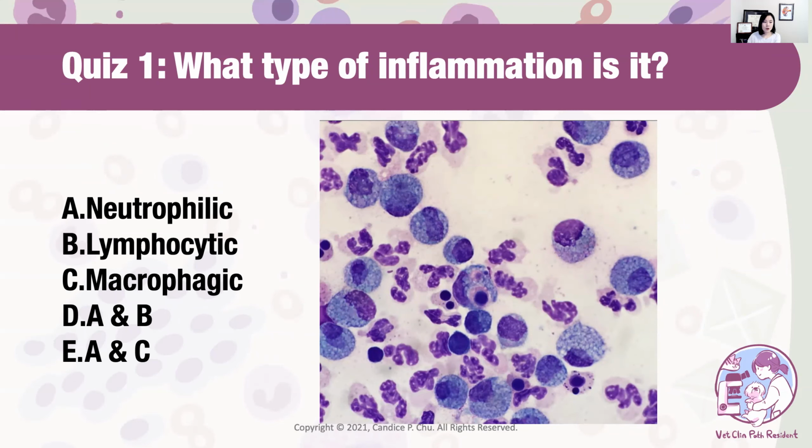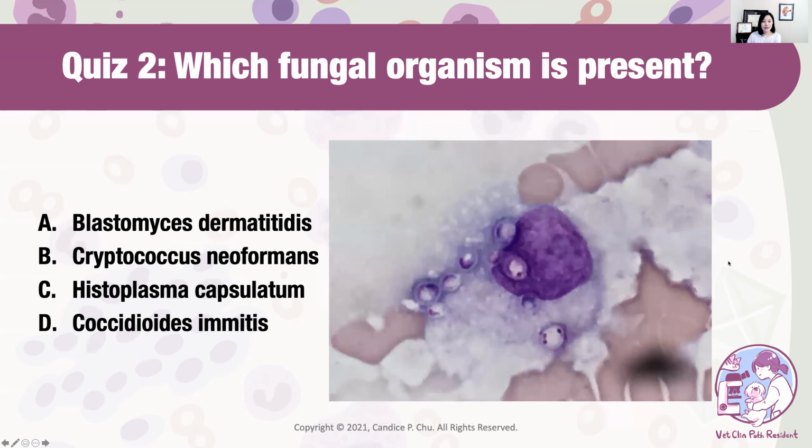Yeah, so you would choose either neutrophilic, lymphocytic, macrophagic, or neutrophilic and lymphocytic, or neutrophilic and macrophagic. All right, so pick your answer, write it down somewhere, and then we will be jumping to the next question.